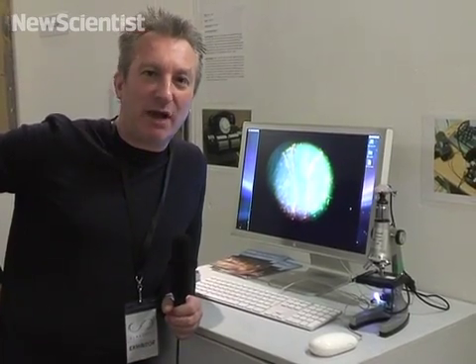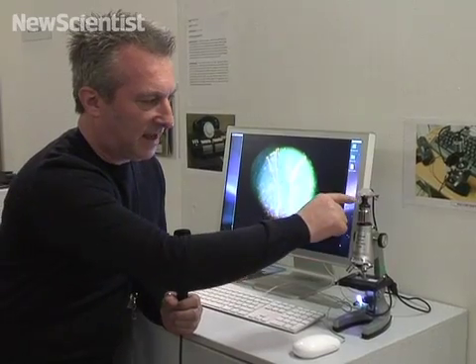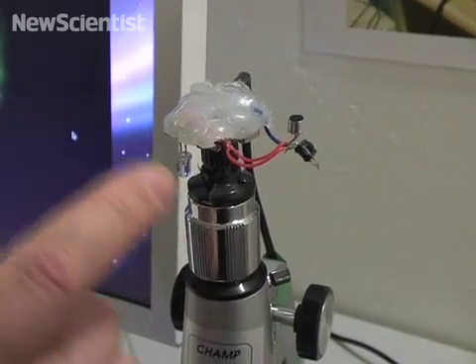Hi, my name is Lewis Sykes and today I'm here to show you how to make your own USB digital microscope. Here's one I made a few weeks back. Here you can see that the web camera has been dismantled, glued up, and stuck to the top of the microscope.